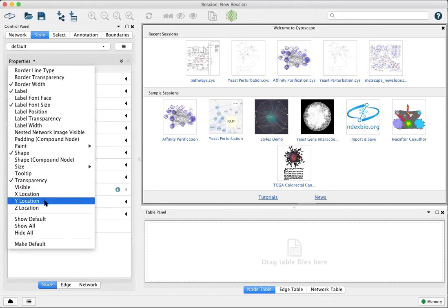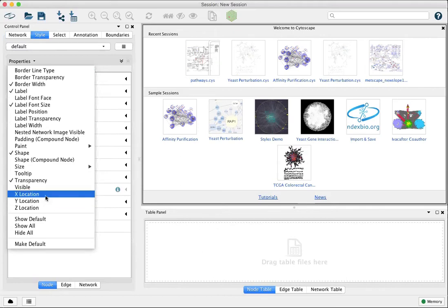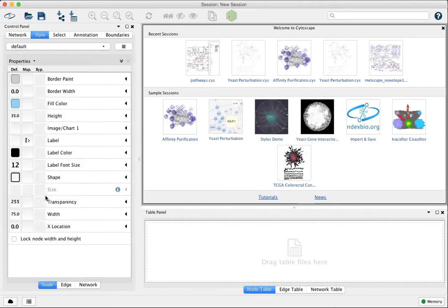For example, to position nodes according to geographic longitude and latitude. So you just select on any of these and they'll be added to the view here.